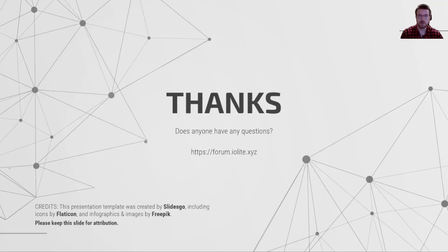That concludes our introduction to Python packages, iolite's Python API, and plugins in iolite. If you have any questions, please visit the relevant thread on the forum at forum.iolite.xyz. Bence will now take you through an example importer and discuss this week's exercise.